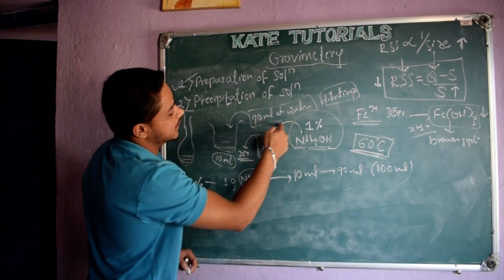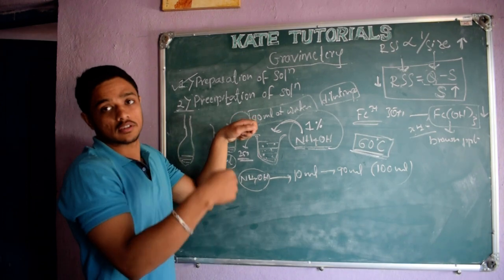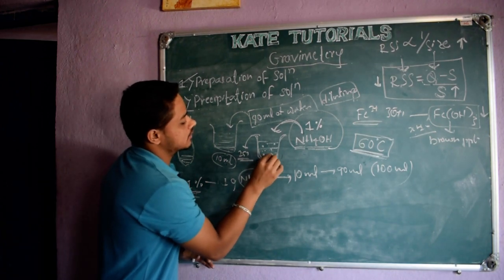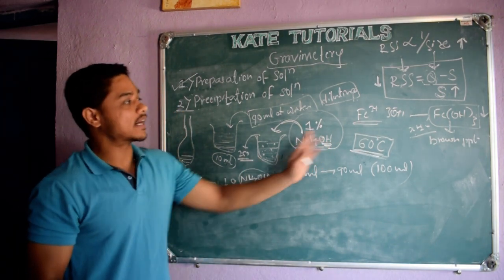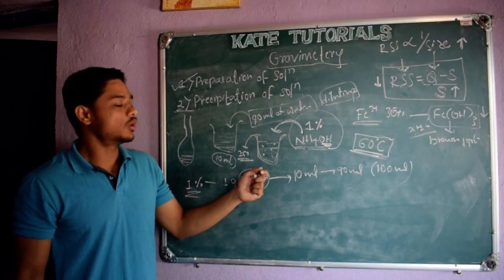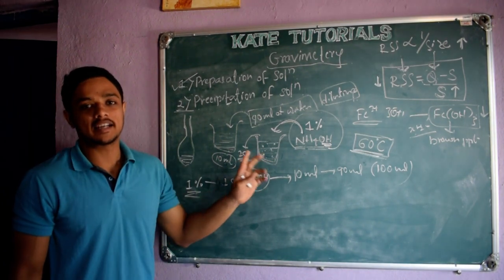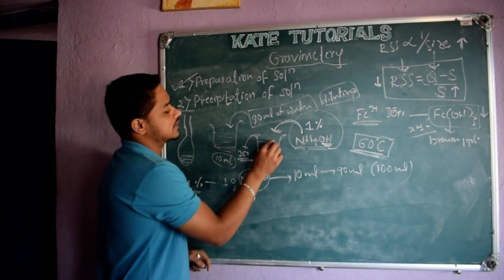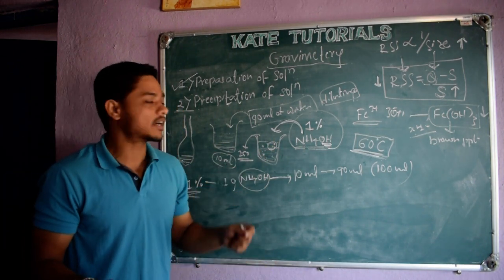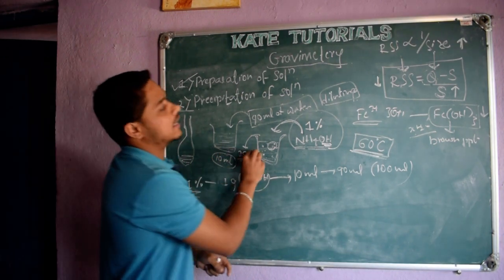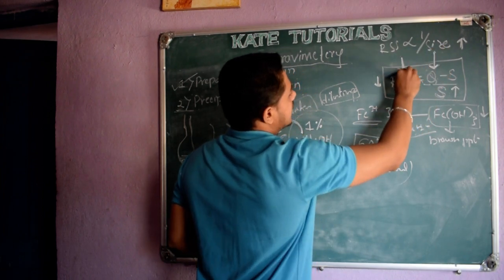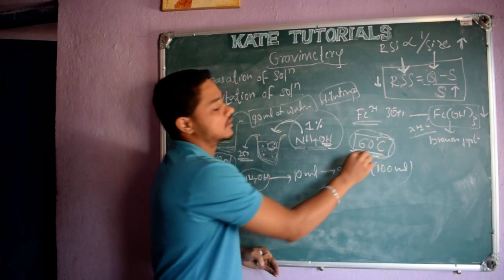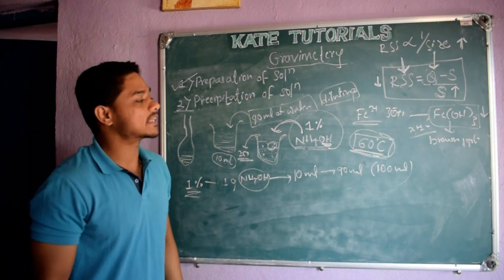And while adding this precipitating agent, what we do — we take that glass rod and we continuously stir it. Why we stir? So that we make sure that every Fe3+ ion should react with this OH⁻ ion to get that crystal Fe(OH)₃ precipitate. We make sure that the whole solution is delocalized — that is, we minimize the localization effect. If you add directly, localization effect occurs — only a small amount of Fe3+ is suddenly precipitated and the remaining may not precipitate. By stirring, it keeps the Q value low. If Q value is low, RSS value will be low. So, we stir, we use dilute solution, and we make all the reactions at elevated temperature. All three have been explained. If you were asked in the exam, you need to write everything.